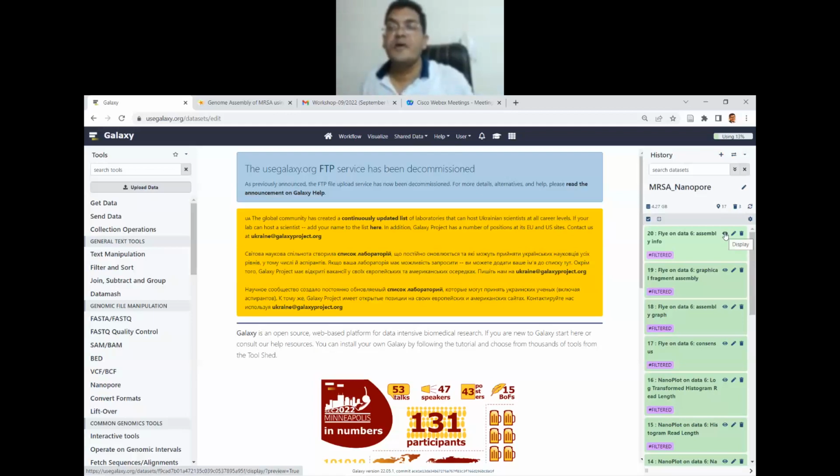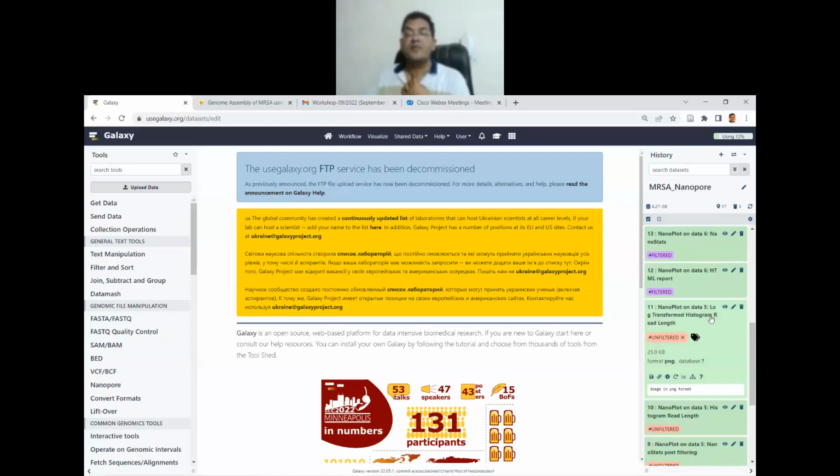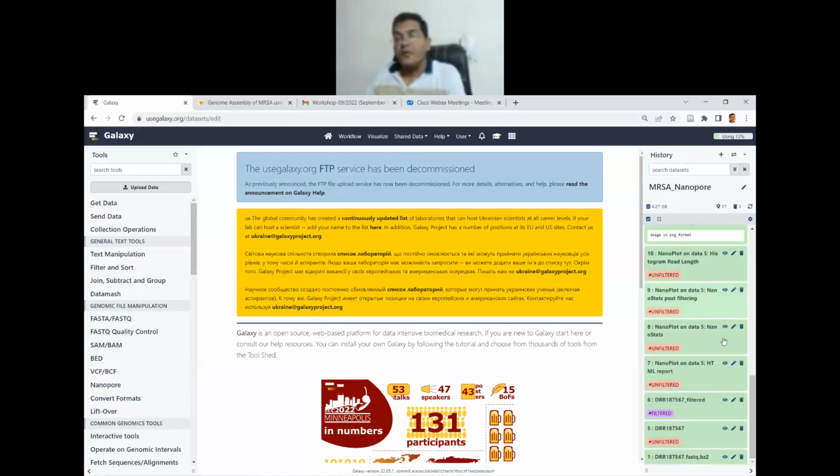to process, right? So what you can also do is, in case you go wrong, you can delete your files from here and redo the step with correct inputs again, right? So for somebody who got stuck, you could delete your process here. When you delete these files, your process would start from the next number. So if you delete the 20 file, the next process would be 21 here. It would not be 19 to 20.